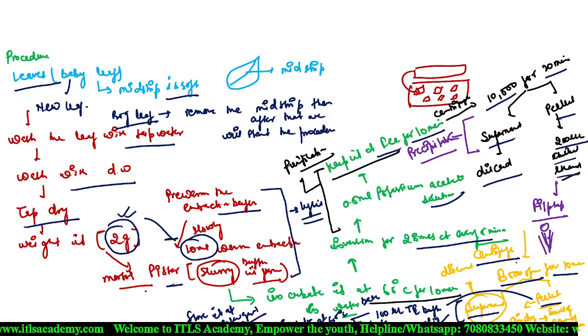In case when you decrease its temperature and then again add the potassium acetate, there are some impurities that are present in your substance. When you do that centrifuge, they are completely removed from your pellet, and you get this pellet, which is a very purified form of that DNA molecule.